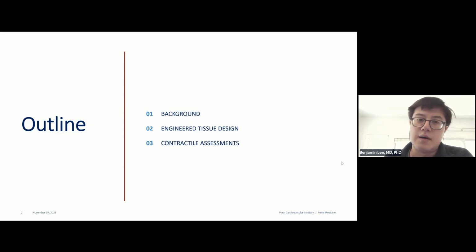And so this is going to be a brief talk, just looking at a brief background on EHTs, our tissue design, and some of the early contractile assessments that we're doing.